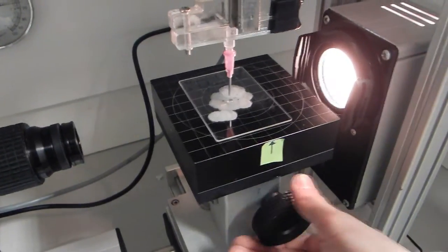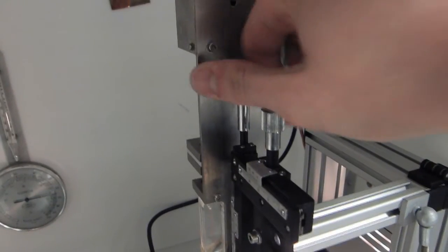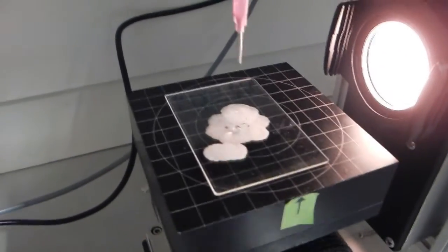When the measurement is complete, we wind the stage down and raise the syringe out of the way. The sample can then be removed from the stage.